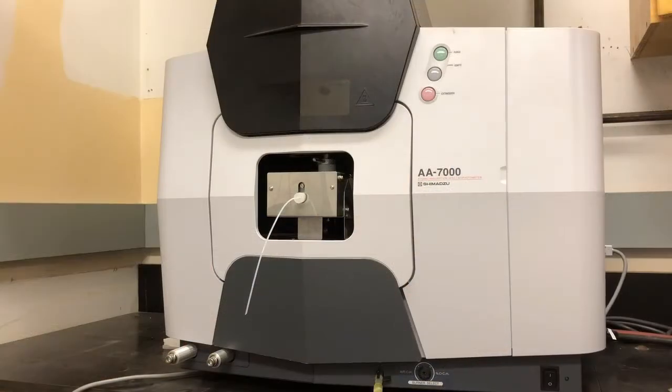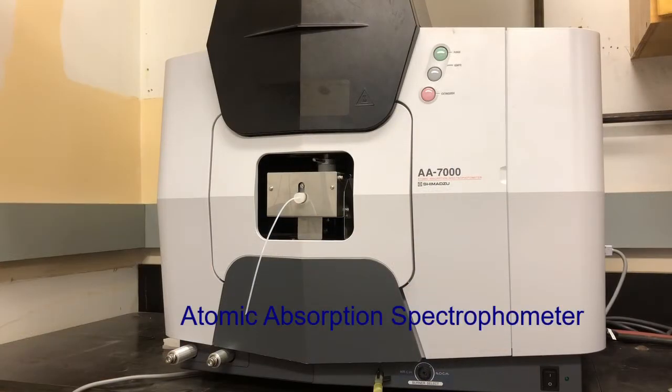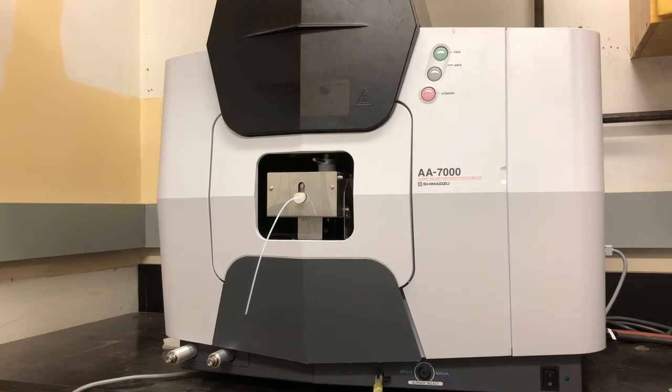This is the atomic absorption spectrophotometer. This is the AA7000 model made by Shimadzu. So I just want to show you the instrument and point out some of its main components.